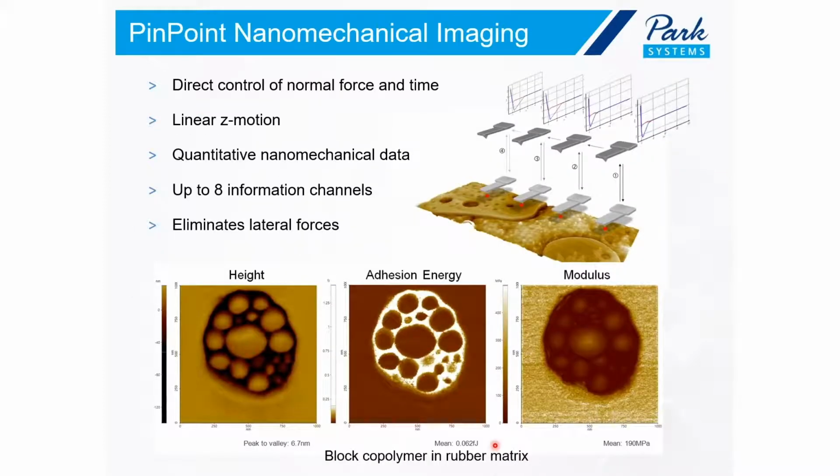I want to list some of the advantages of pinpoint. It offers direct control of normal force and the contact time. This will be important in what I'm going to talk about next, since for conductive pinpoint, we need to stay in contact with the surface for a little longer. The motion of the Z piezo is linear. It's not a sinusoidal motion. It gives you quantitative nanomechanical data, as I have already demonstrated.